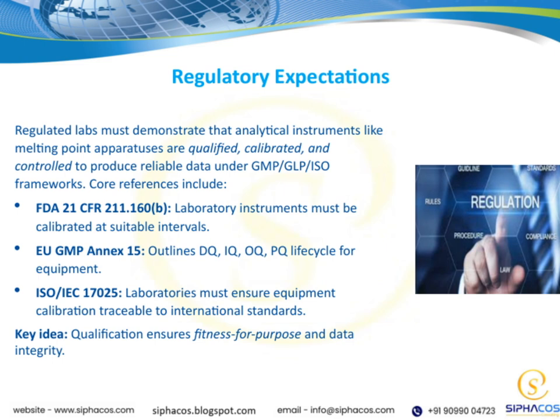Then there's EU GMP Annex 15, which provides a comprehensive outline of the entire life cycle for equipment, including design qualification, installation qualification, operational qualification, and performance qualification, often summarized as DQ, IQ, OQ, PQ. This ensures that equipment is fit for purpose from start to finish.